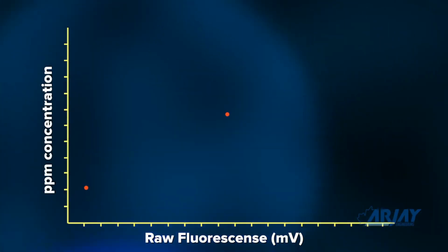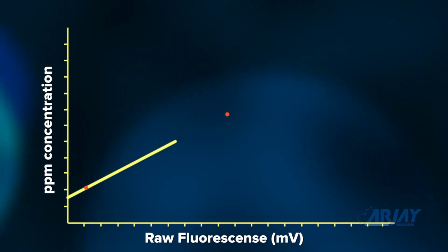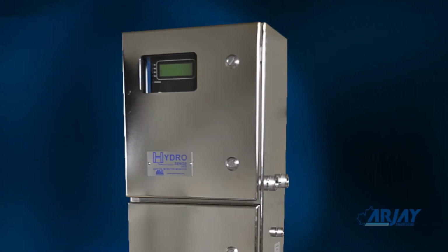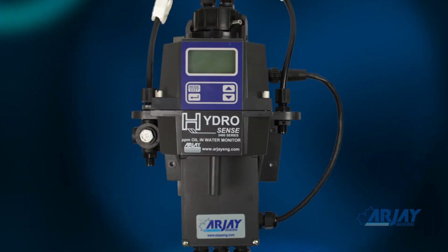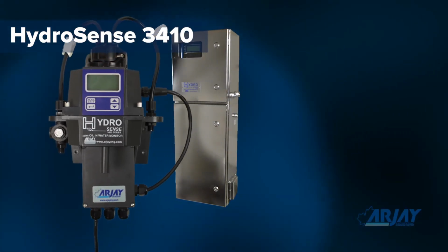A site calibration is done to provide a measurement that correlates the aromatic reading to a total oil reading. This total oil reading is determined against the laboratory method of your choice. Since there could be other variables in the process that might affect the reading of any field instrument, it is important to understand the technology of your instrument and interpret the data accordingly.